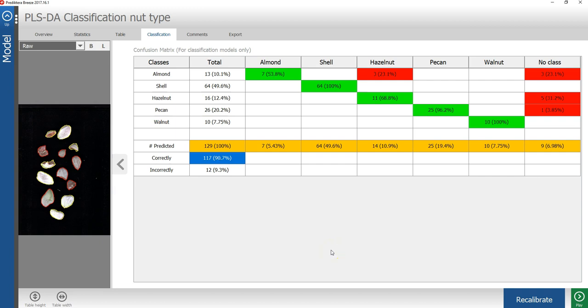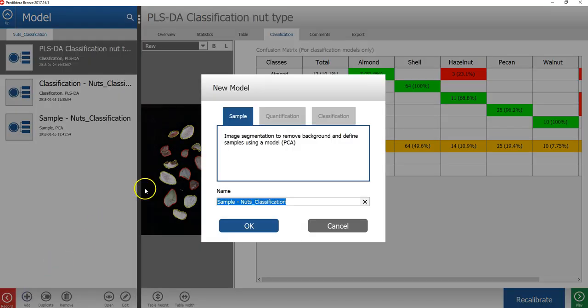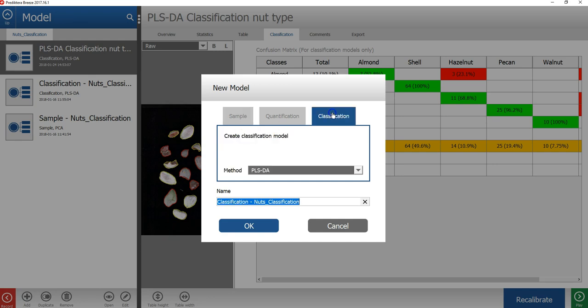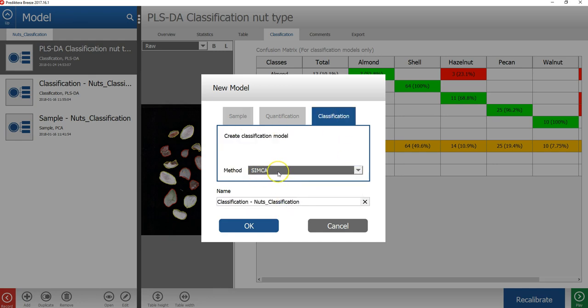Let's compare the PLSDA model with a different classification method to see if we can get a better model. Press the add button, go to the classification tab, and this time I will select to use the Simca method. I will then also write a name for this model.